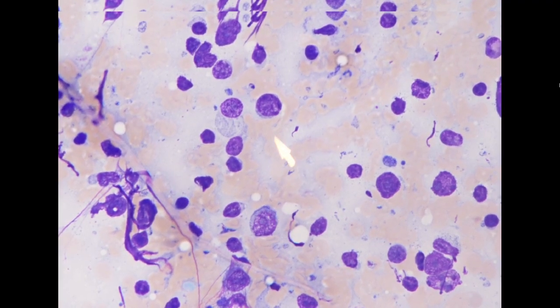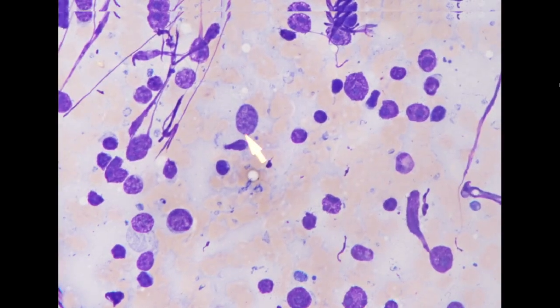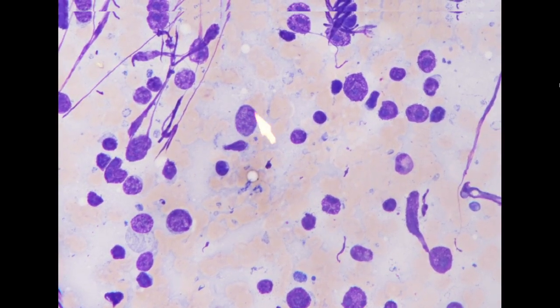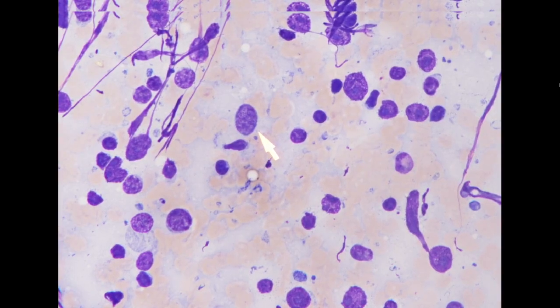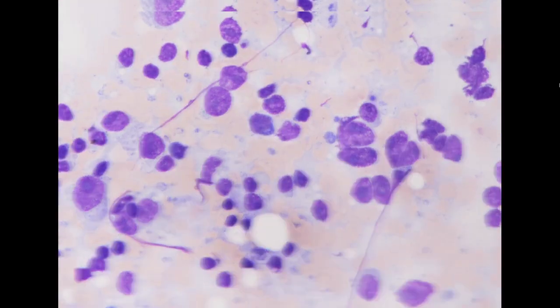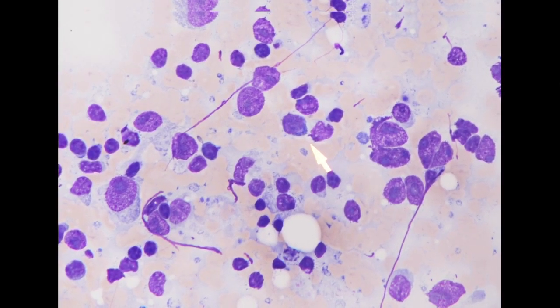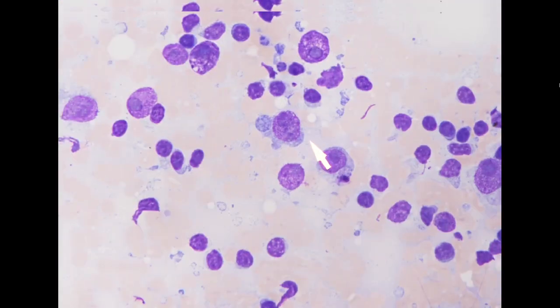This is a pretty good sign that suggests these are of lymphocytic lineage. Sometimes the cytoplasm is very scant, but you can still see a very thin basophilic rimming around these atypical cells. So these are most likely to be lymphoma, and we will wait for the staining result.